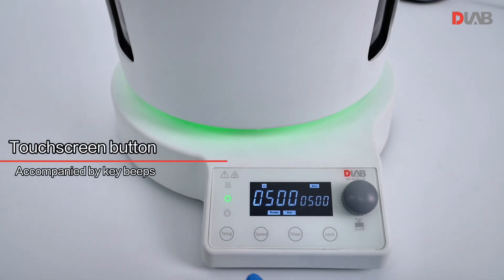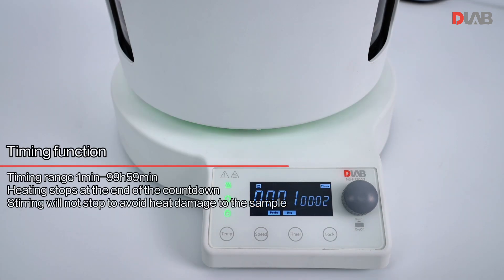Touch screen button accompanied by key beats. Timing function: heating stops at the end of the countdown, while stirring will not stop to avoid heat damage to the sample.